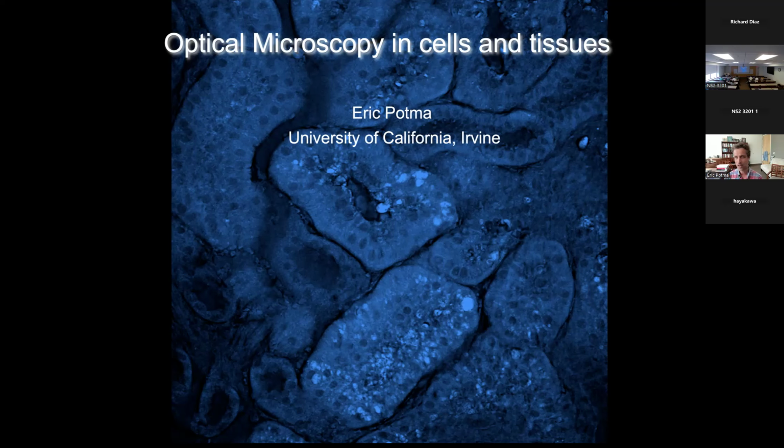What you will be hearing, maybe some of you already know this and you feel like, I learned nothing new. I'm sorry. But I think, just by presenting this, hopefully you will take something away from it. The emphasis is really on what information you can extract from the sample using these kinds of nonlinear optical techniques, and when is it not a good idea? So that's the main scope.